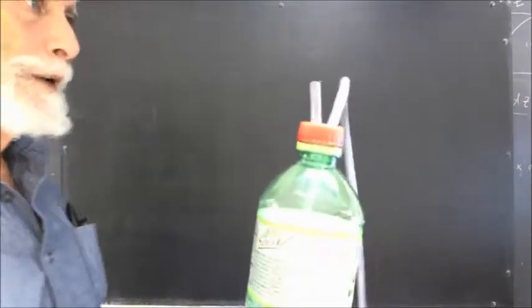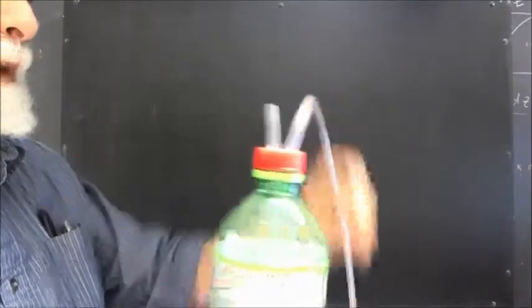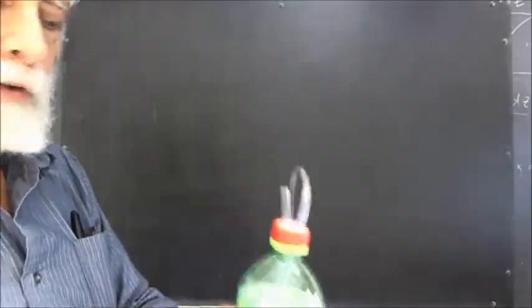So here's a bottle with a cap and only two tubes coming out of the cap. One is the long tube and the other is the short tube. How do we manage to get a pressure tube on this?